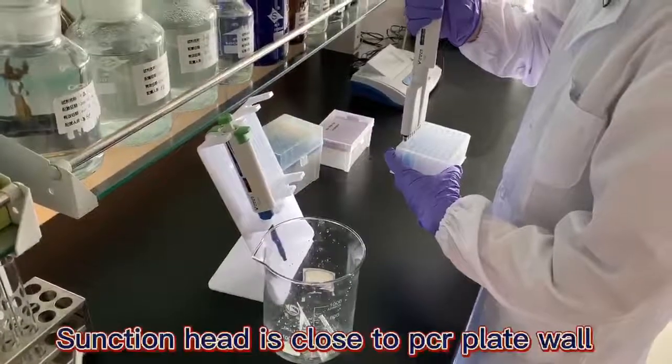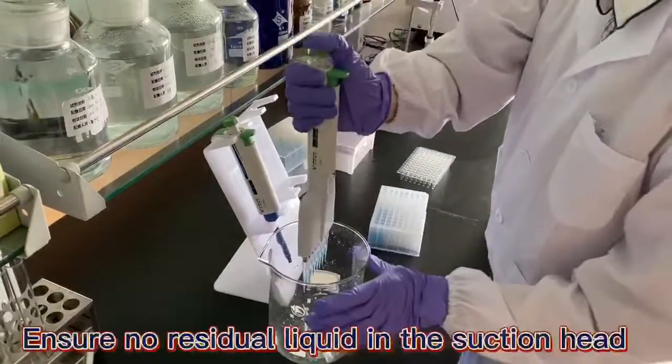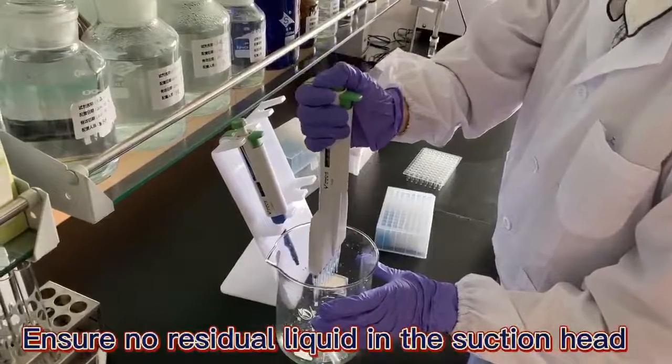Discharging: hold the suction head close to the PCR plate wall and press it to the second stop point. Ensure there is no residual liquid in the suction head.